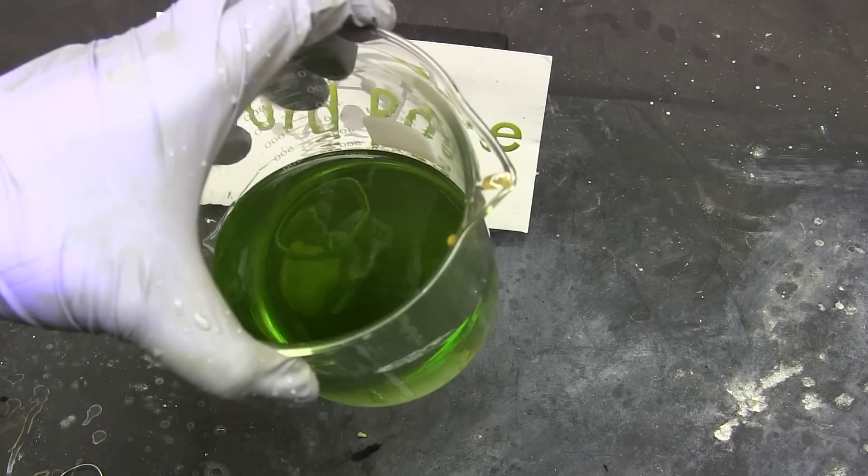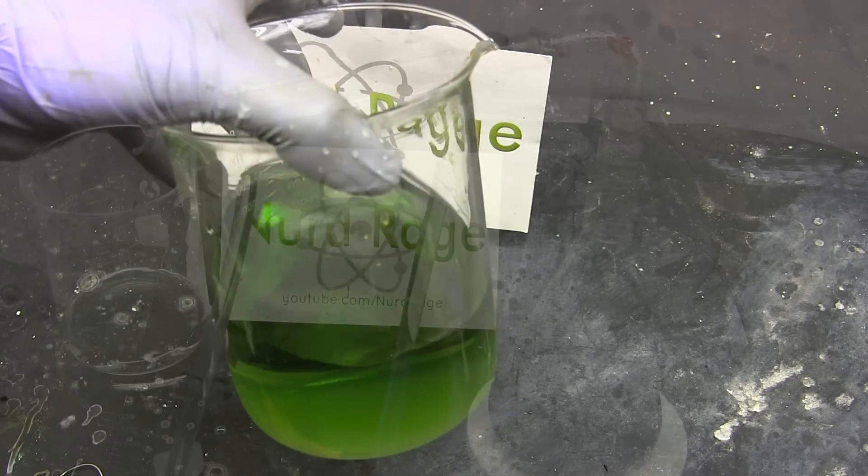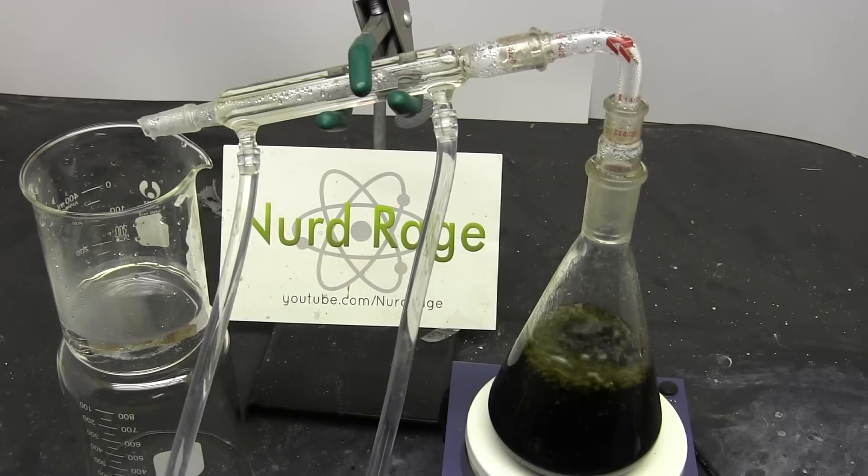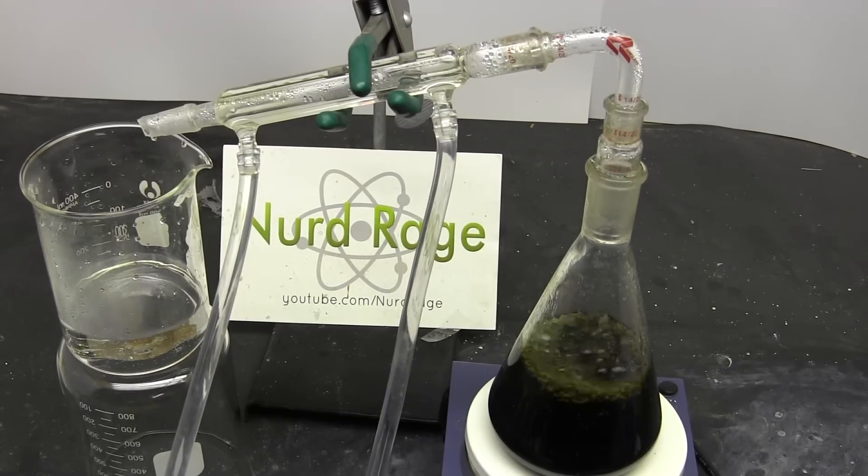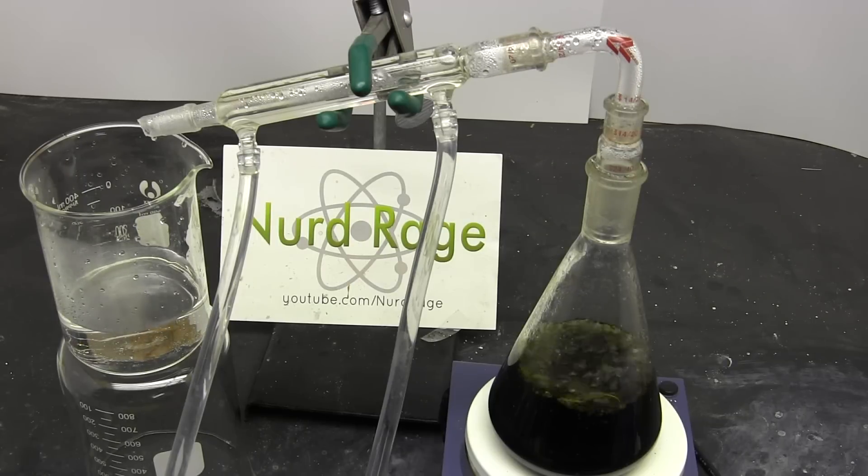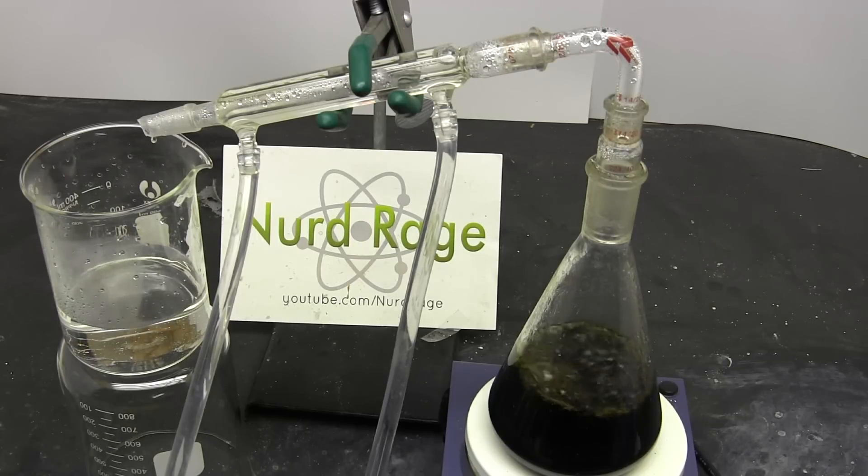Now we need to deal with the iron 2 chloride. Boil it down to a volume that corresponds to the difference between how much hydrochloric acid was recovered and the original volume. Since I recovered 300mL of hydrochloric acid and my original volume of ferric chloride was 400mL I'll need to boil it down to 100mL.